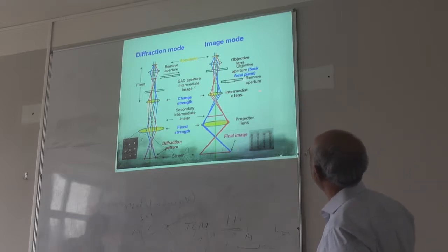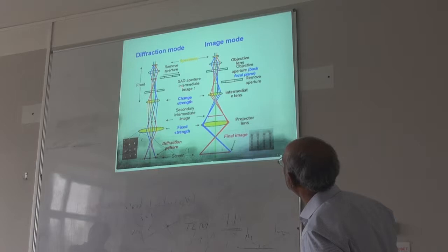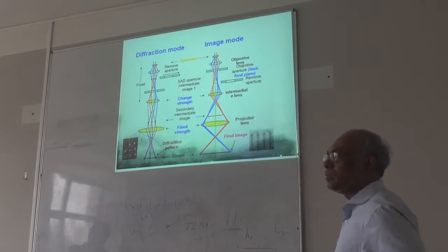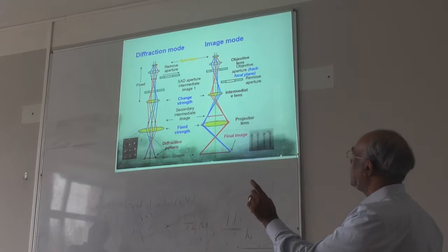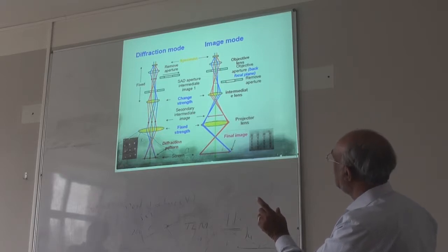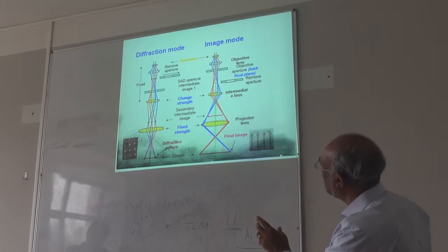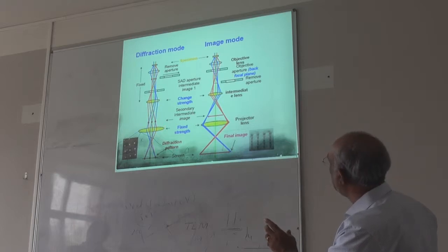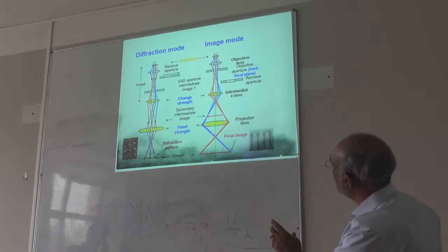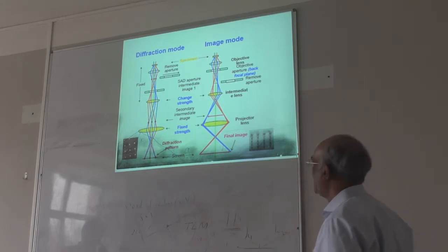So basically, does it depend on the aperture change? Yes, that changes your focal length and everything. Then you have to be in the diffraction mode. You need to get light diffracted from here, right? After this one. But here you just need to focus the image onto this one. That's the only difference. It's very simple. Just push and pull. That's all. Always we do the two.